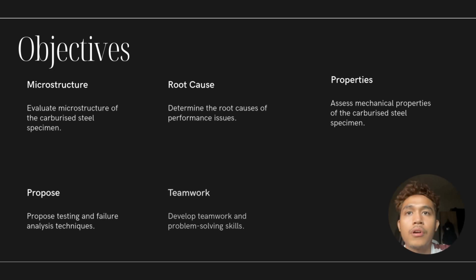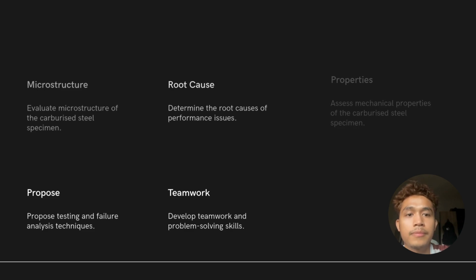The objectives of this project are to evaluate the microstructure of the carburized steel specimen, determine the root cause of performance issues, assess the mechanical properties of the carburized steel specimen, propose testing and failure analysis techniques, and lastly, to develop teamwork and problem-solving skills.